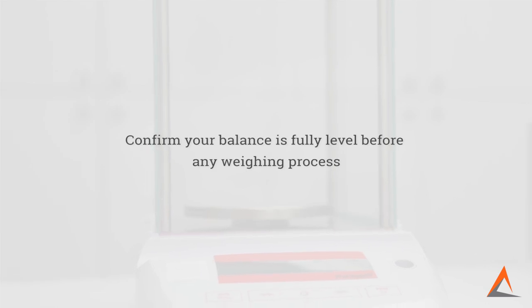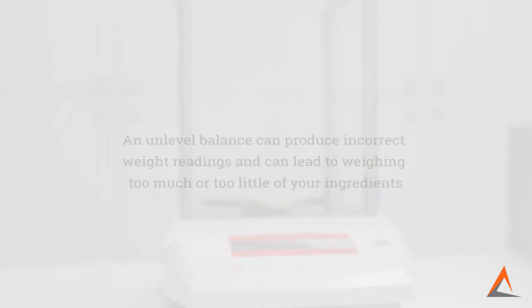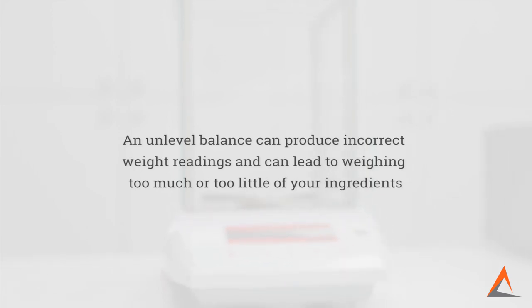After you have selected the most suitable location for your electronic balance, the next step is to ensure it is level. You always want to confirm that your balance is fully level before any weighing process, as an unlevel balance can produce incorrect weight readings and can lead to weighing either too much or too little of your ingredients.